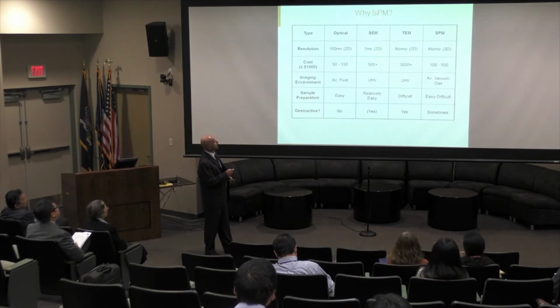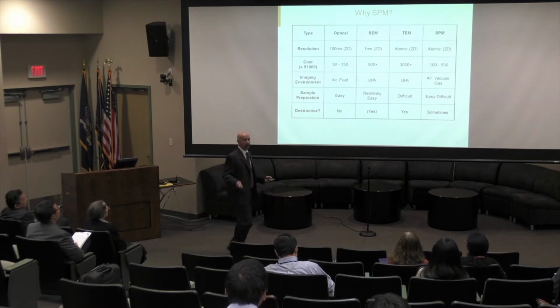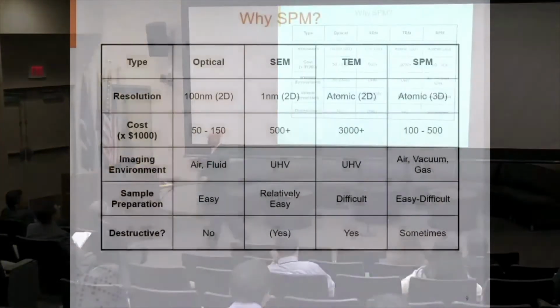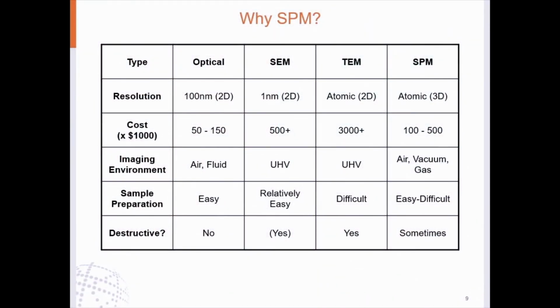And this is just a little bit more on why scanning probe microscopy has lent itself so well to analyzing the latest technologies, because everything's gotten so small. Here, optical techniques you still need for looking at devices on a macro scale, which is a macro scale now, really. SEM is employed quite a bit, but we're really relying on TEM and SPM.